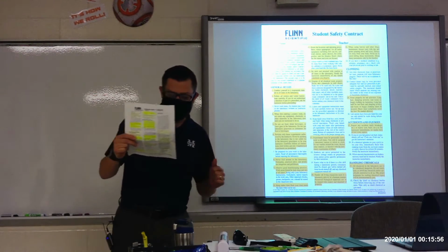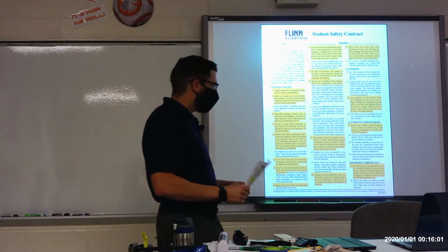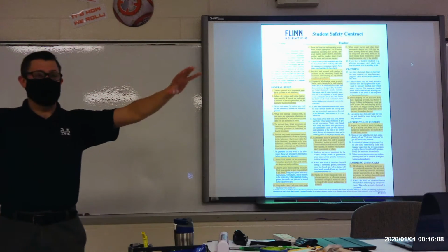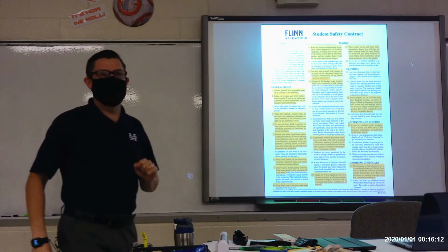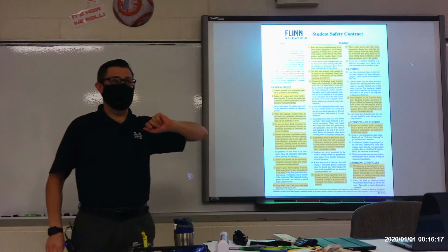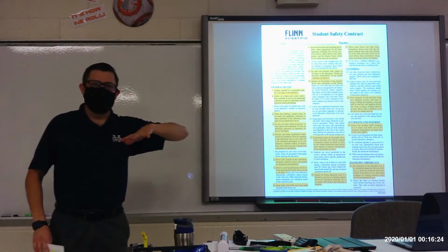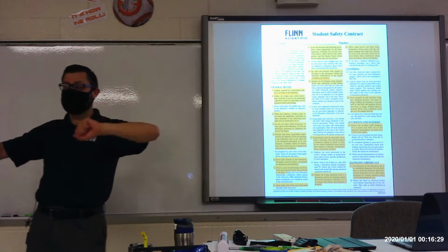Number 9, observe good housekeeping practices. Work areas should be kept clean and tidy. When you walk into my classroom for a lab, the room will have been straightened up. My first period will have done their lab and cleaned up after themselves. If you walk in and there's a mess at your station, I want to know, because I'm going to hold my previous class responsible. But when you're done with that lab, you're going to clean up everything and leave everything as clean and tidy as you found it.